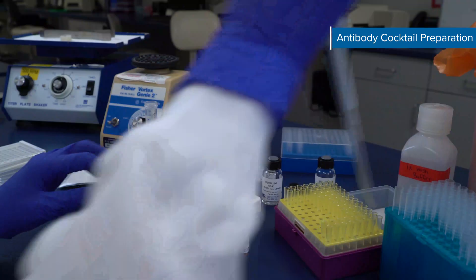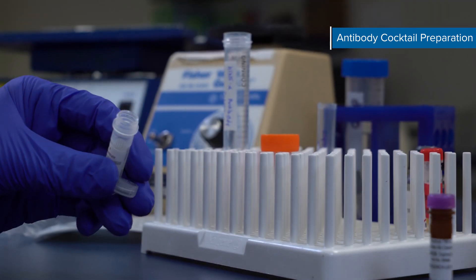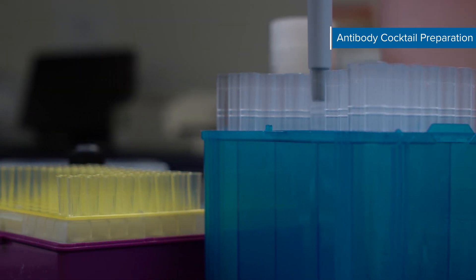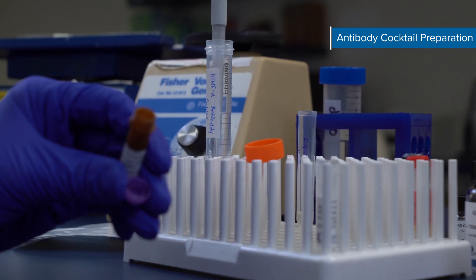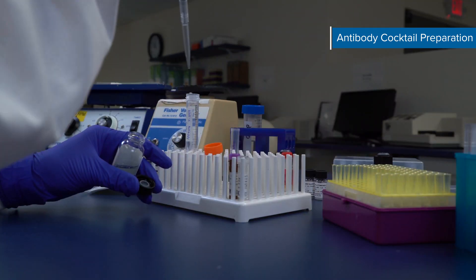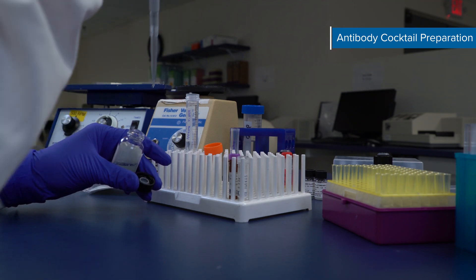Next, in a 15 mL conical tube, add 300 µL of the reconstituted capture antibody concentrate and 300 µL of the detection antibody concentrate to 5.4 mL of the specified diluent. This produces 6 mL of antibody cocktail. Avoid vigorous mixing.